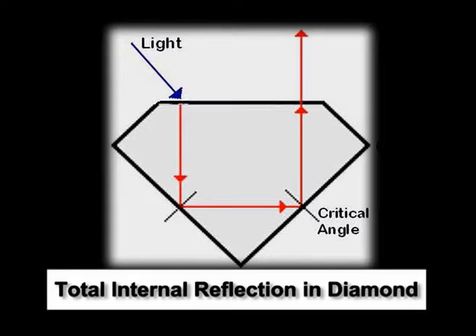That is, it will come back to the medium of incidence and no ray will go to the second medium. Now, total internal reflection is of important use in biology. So what are the uses of total internal reflection in biology? The uses of total internal reflection in biology are manifold. One of the prime examples is a problem. The problem in light microscopy is too much light.